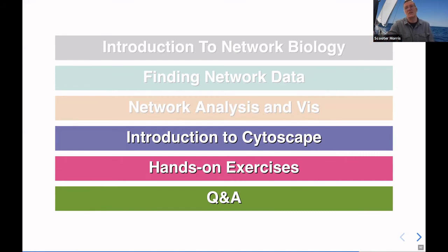And once I've done that, now I can begin looking at these particular genes, these particular proteins, and start asking different questions. And the whole idea, I think, if you look at network analysis, is that there are two really important functions here.